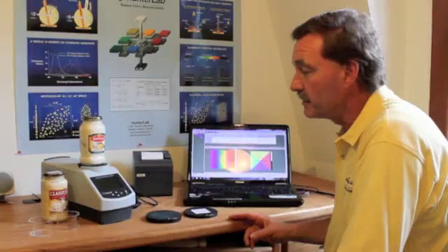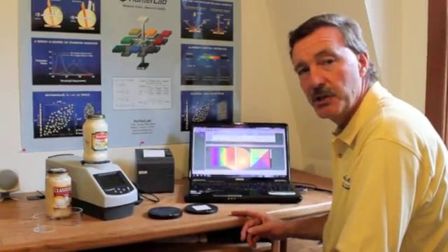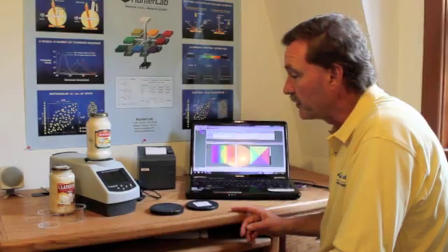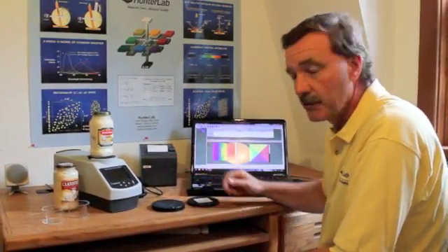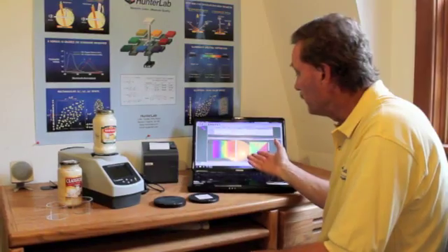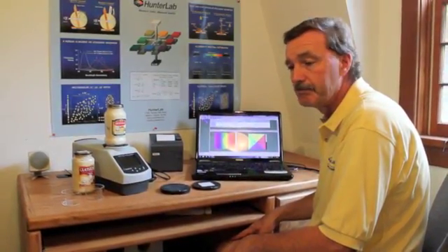So this is one example of HunterLab's solutions. This is a $10,000 EasyMatch QC system, which functions with barcode readers, various printers, our EasyMatch QC software, which can also export information to network servers, along with sending data to Excel files.